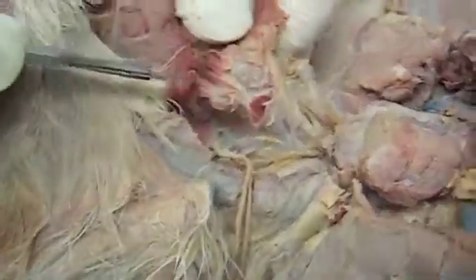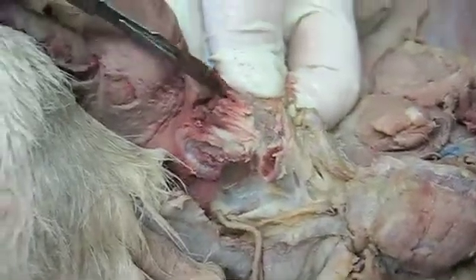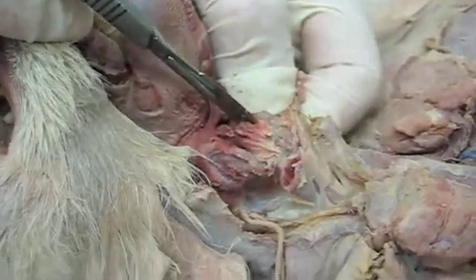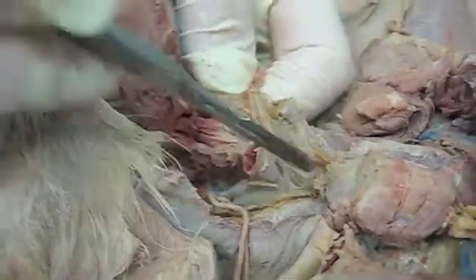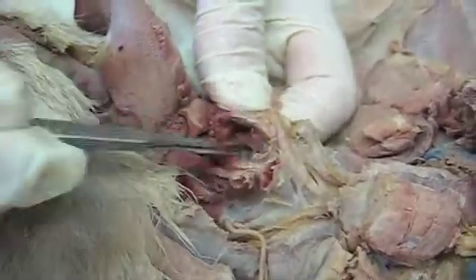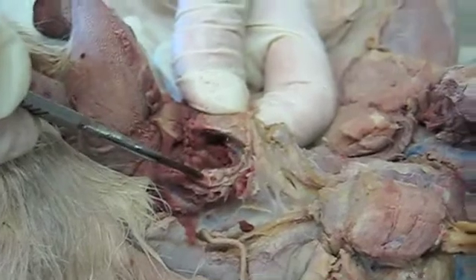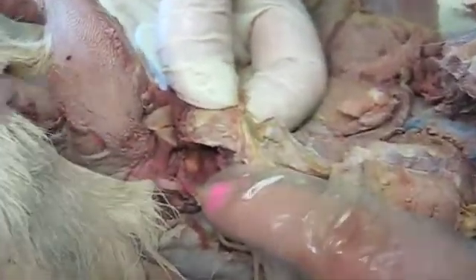So then here, if I flip this over a little bit more, now I'm going to cut right through that slit-like glottis, right there. Okay. So we'll see the glottis. Okay, and then when I pull this over, do you see that sort of white, fleshy piece of tissue? Yes. Right, right in there. That's the true vocal cord. Again, there's one on each side.